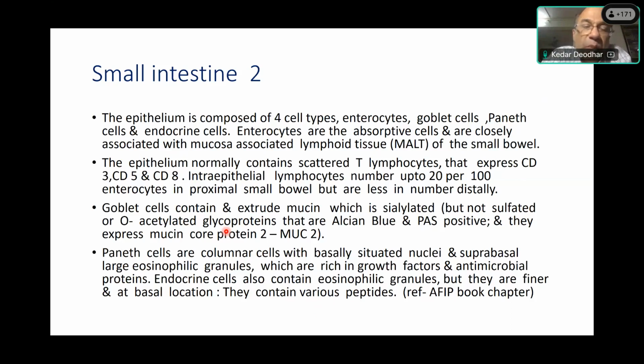In chronic inflammatory bowel disease, especially in the left side of the colon, we look for Paneth cell metaplasia, because this is the body's repair response with growth factors and antimicrobial proteins. They are normal in small intestine. They are normal probably in the proximal part of the ascending colon, but they are not normal in the left side of the colon. So that's a curious and interesting cell.